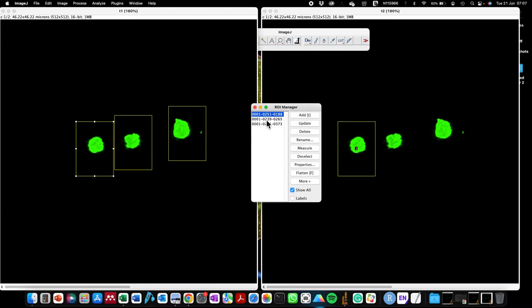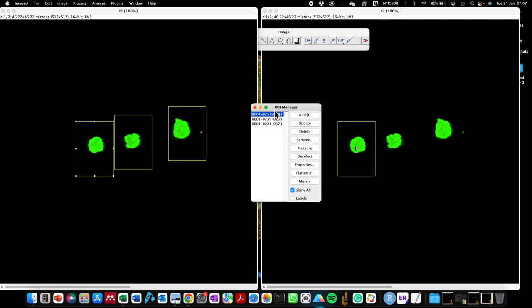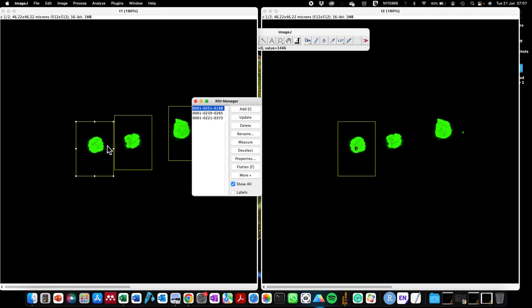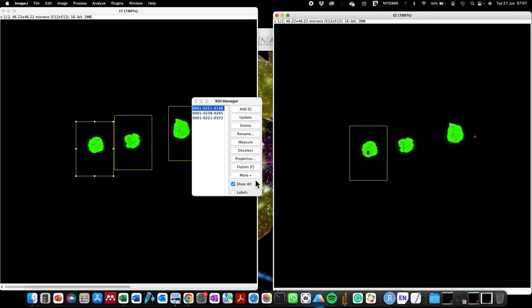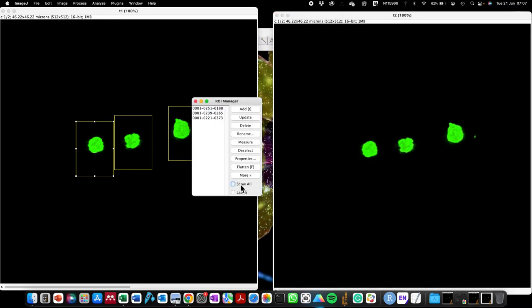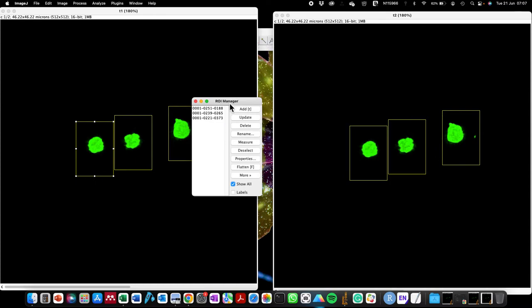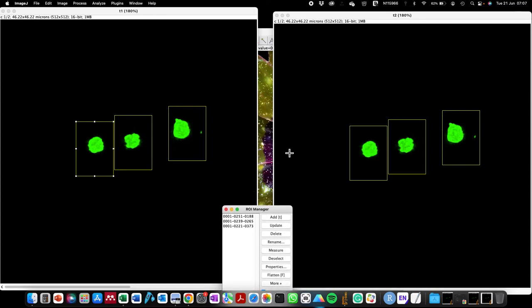The coordinates of each of these regions of interest have been added to the memory of the ROI Manager. If I want to paste these three regions of interest on the duplicated image on the right, I just click on it and click Show All. As you can see, we now have the regions of interest pasted and duplicated at the same exact locations on the duplicated image.